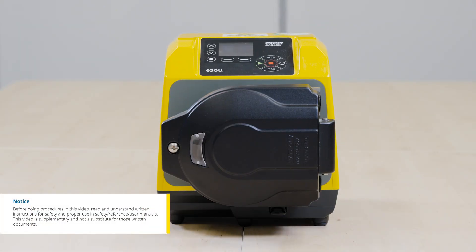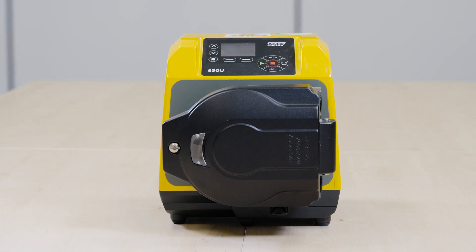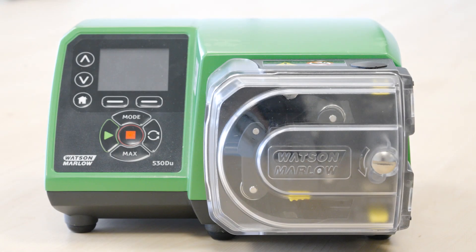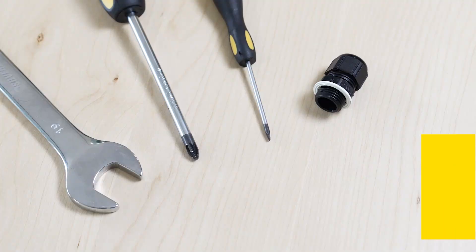In this video we are going to show you how to wire in functionality to a Watson-Marlow 630 peristaltic pump with N module. For demonstration purposes we'll be using a Watson-Marlow 530 peristaltic pump. These are the tools you'll need.